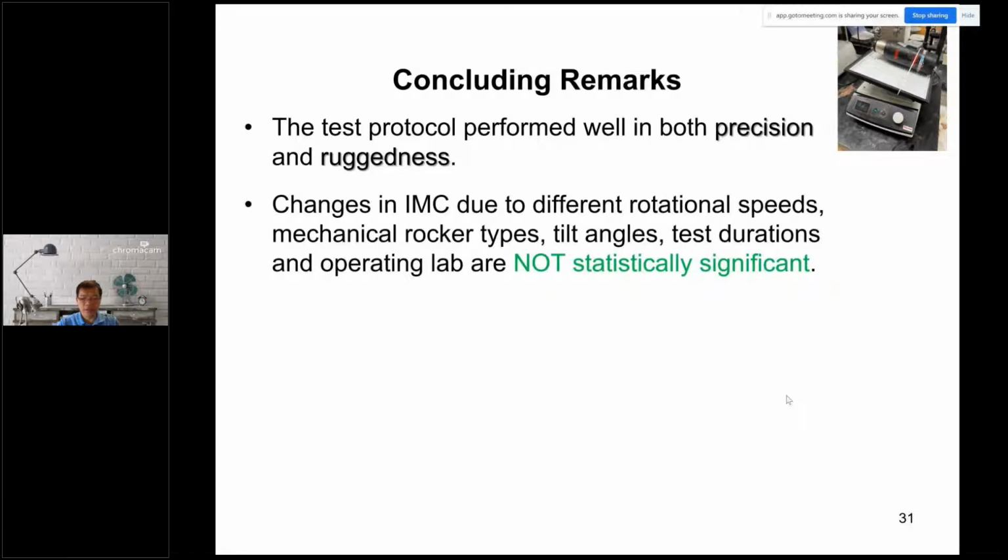That tells us part of the variation came from this relatively high coefficient of variance. In the beginning of the test, we debated whether or not we should go with a much lower coefficient of variance, lower than 10%. I think we agreed that we'll take all the data points which are within 10% COV, or coefficient of variance. In implementation, we probably would be a lot more stringent and lower that 10% down to something like 6%.